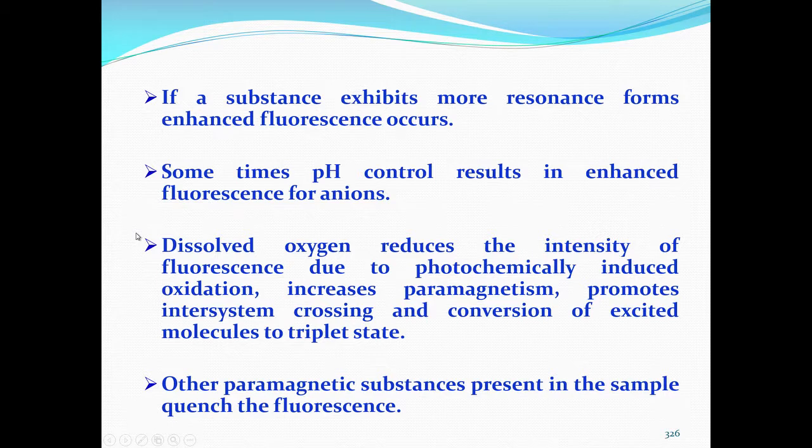So, it is very important in most of these spectrophotometric procedures as well as fluorescence procedures that the system should be kept covered and there should not be much interaction with oxygen. Similarly, other paramagnetic substances also will reduce the fluorescence. Reduction of fluorescence is normally referred to as quenching the fluorescence.